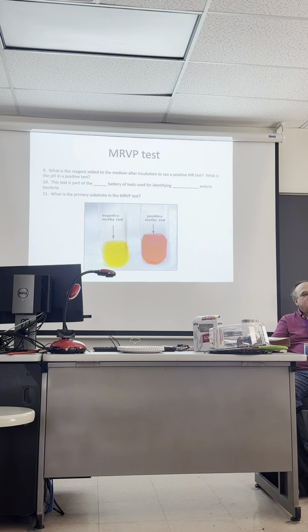What does it indicate? What end products does it indicate? Acid end products. You don't know which one. It can be lactic acid, it can be pyruvic acid, it can be succinic acid, it can be a whole bunch. We don't know which one, we just know it's acidic.